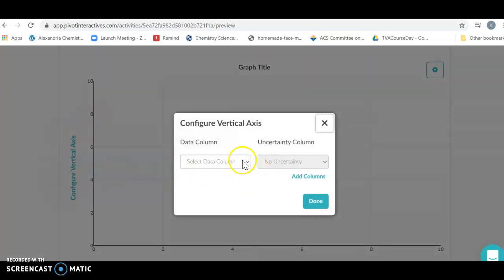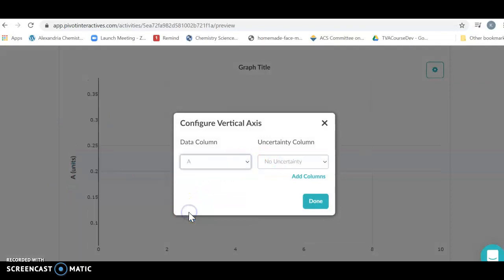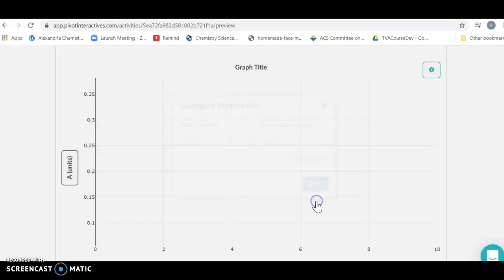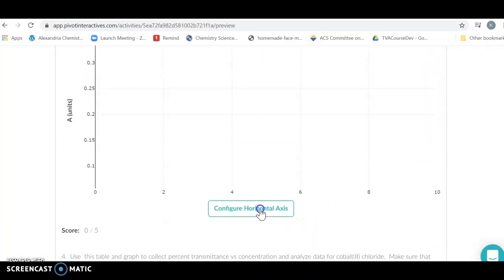If I want to figure out what my y-axis is, my y-axis is going to be my absorbance. You can put some arrows in there, we don't need that for our labs. I'm going to hit done.